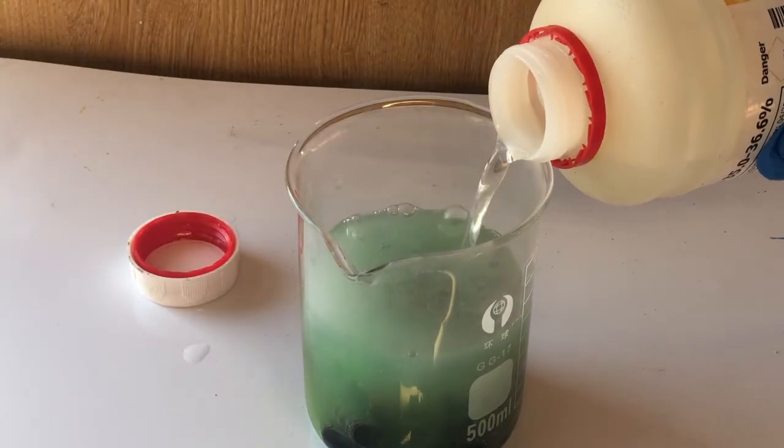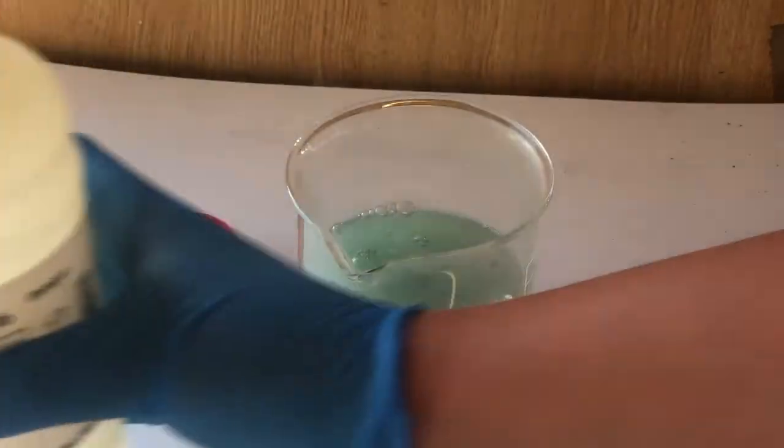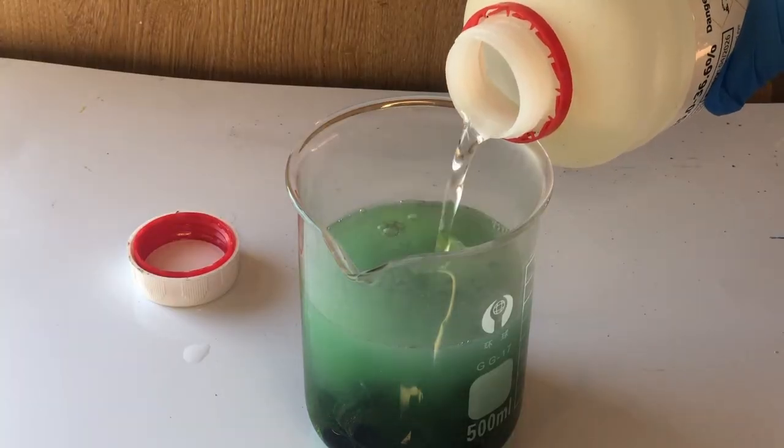After quite a short time, there's a very noticeable colour change. The solution goes from clear to a lime kind of colour.